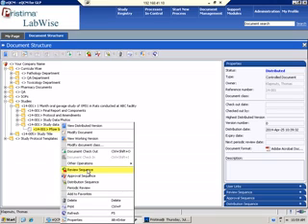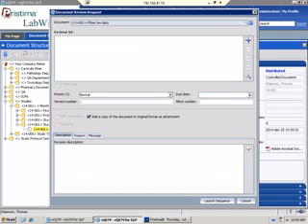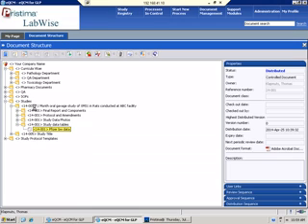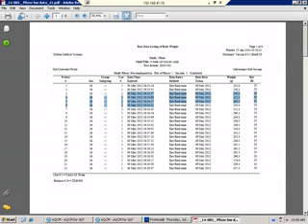Now, being saved in here, you can send it for a review sequence, which could be your QC. And whenever you send a review, there's a due date. So you can give your QC person 2 weeks to do the QC. They'll get an email. They'll get it on their work page that they have 2 weeks to complete the QC of the body weight data. They can then open that document and make changes to it with track changes.